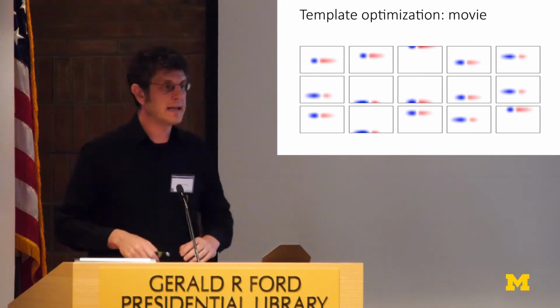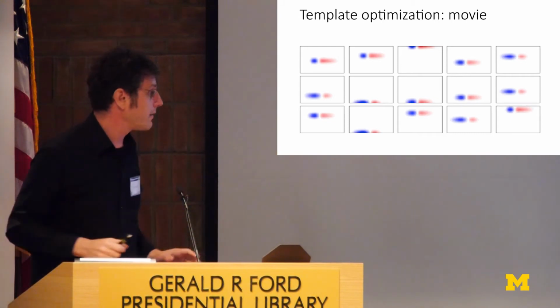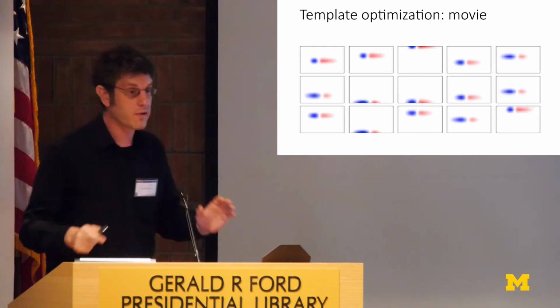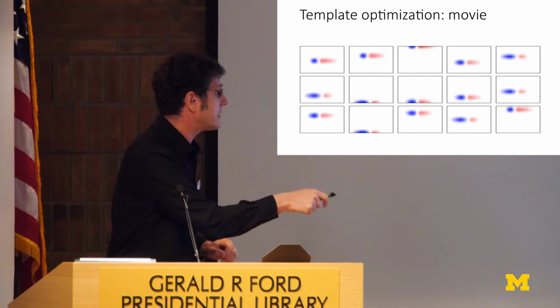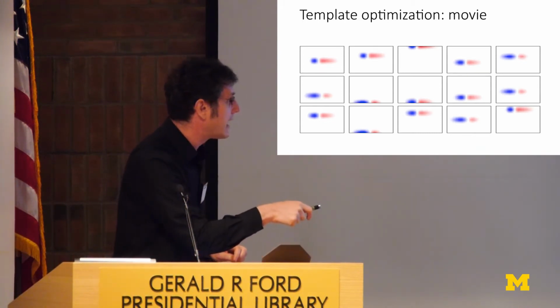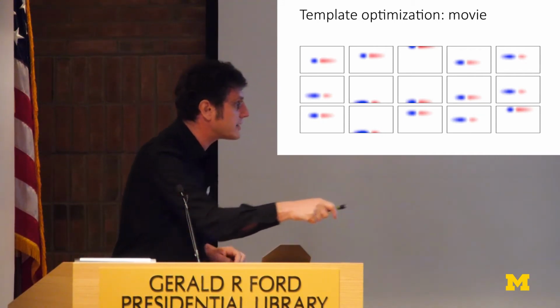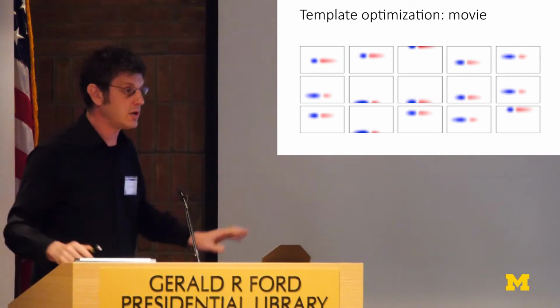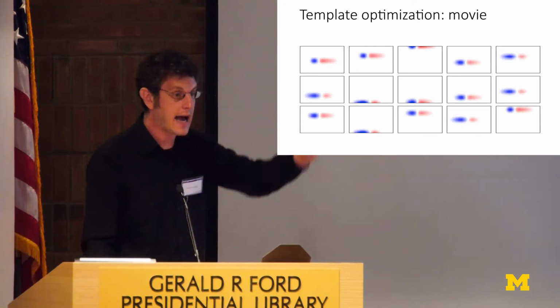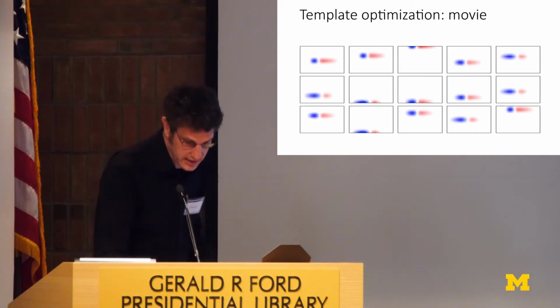Yeah, and those big jumps are deliberate. They're to get it out of local minima that the algorithm gets stuck in. But after a few iterations, it finds some template waveforms that look like this. You've got negativities followed by positivities. You've got the sort of C shapes that you often see due to back-propagating action potentials going up the dendrite. And these are the template waveforms it's found.